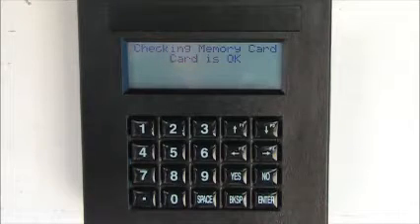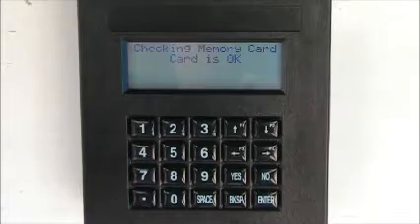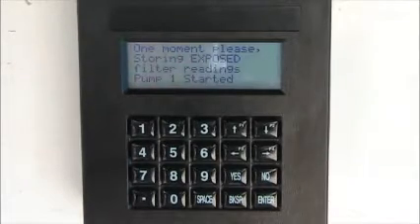The controller will then check the flashcard and download exposed filter readings. You will hear the pumps turn on at this time.